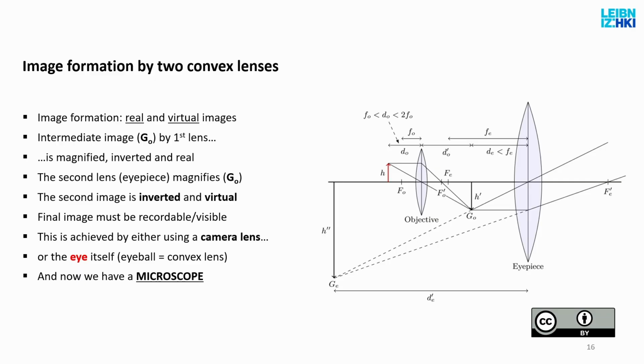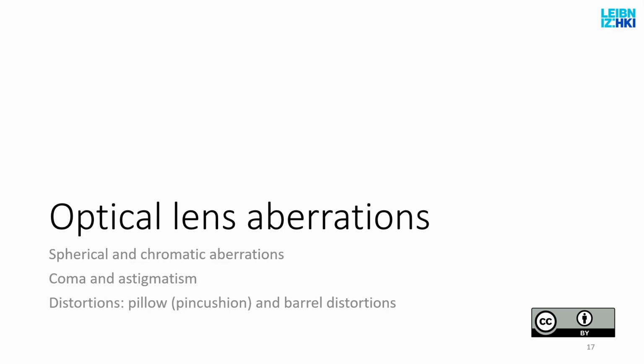So what did I do? If I now have a camera or my eye here, and this is the eyepiece of the microscope, and this is the objective lens of the microscope, what I have here is the simplest form of a microscope. I just built a microscope with two very simple pieces of glass. And this is how it was done when it was first discovered that you can use curved glasses to magnify little creatures like bacteria and single cell living things to generate such a device.